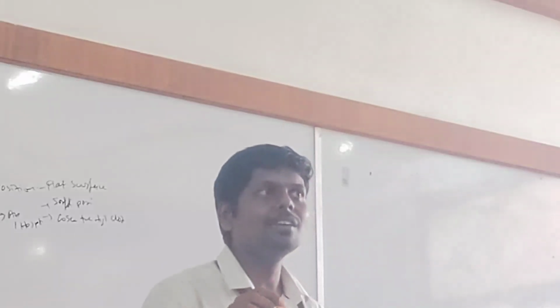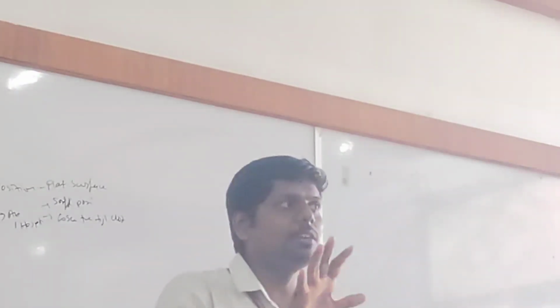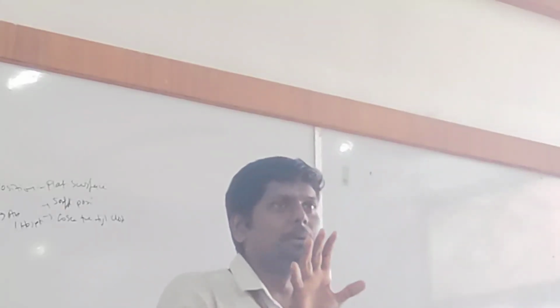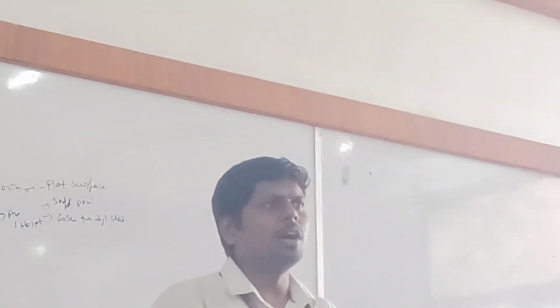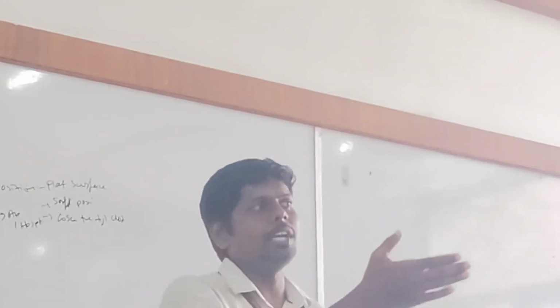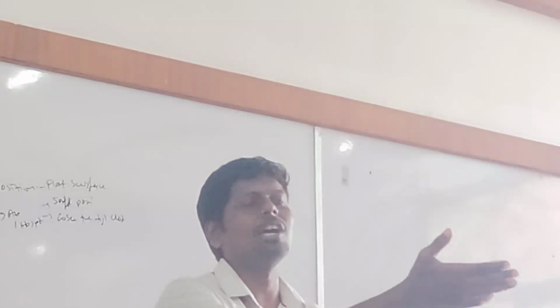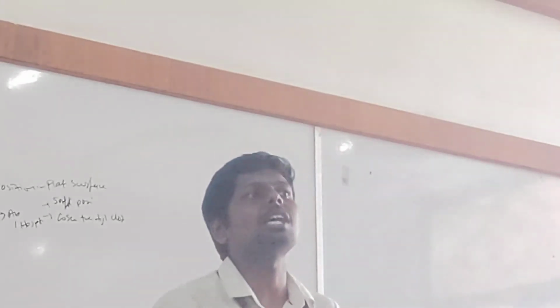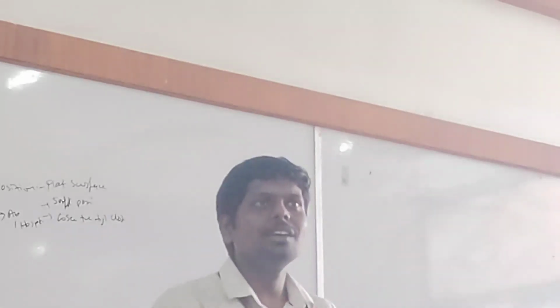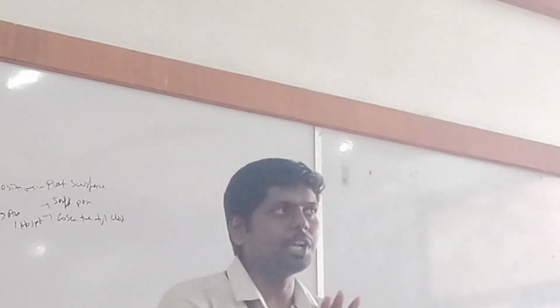I can understand you are in the phase of learning. So take these points and don't do those things. Take note of where you are making mistakes. On ABO grouping day, Jariel accidentally spilled one reagent, the ABO reagent. These are good signs actually. You need not worry, but don't repeat the mistake. Understand the mistake and don't repeat it.